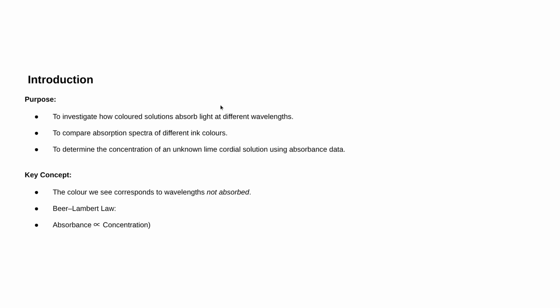The key concepts written below: the Beer-Lambert law. The color we see corresponds to the wavelengths not absorbed, and absorbance is related to concentration. I got this from some sources online as well as self-study, so I referenced them at the end of this presentation.